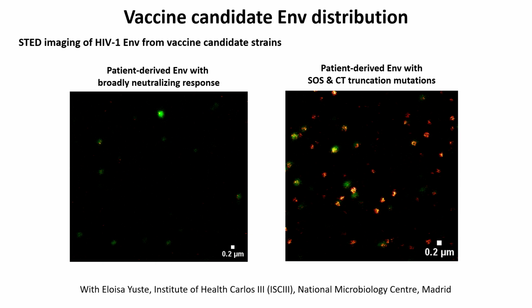Just a small technical note: after revisiting this particular study, I was amazed how easy it is now to take those images. 10, 12 years ago when I was taking these images with STED microscopy, it took quite a lot of time to align the microscope to basically even get the images.